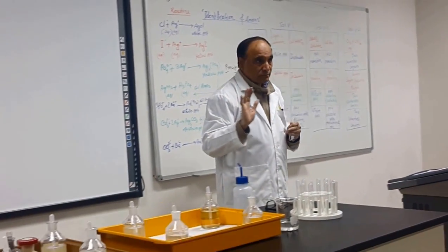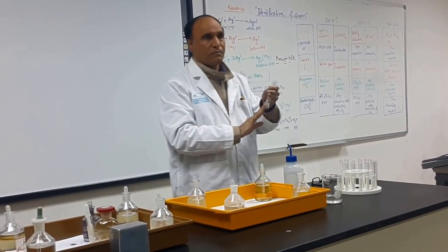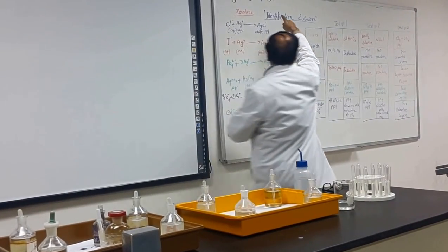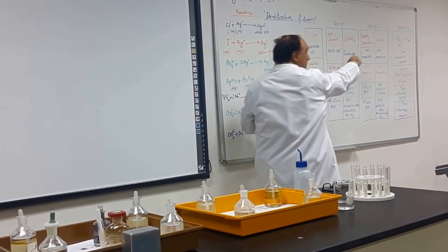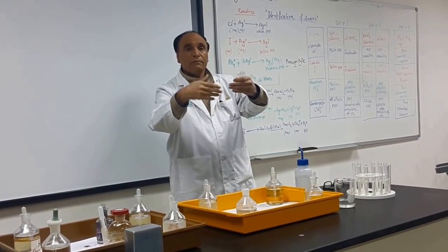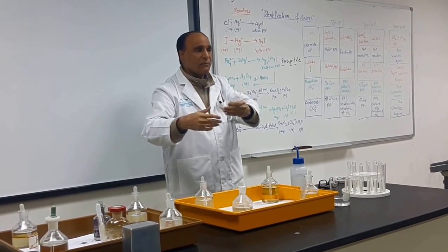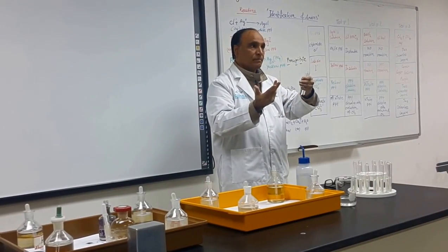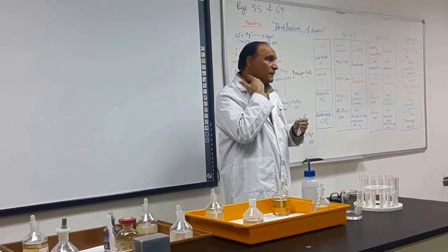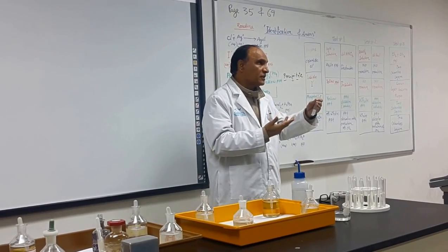Did you understand? Yes. Most of the students, and it is good, use only 3 test tubes. When it is finished, they write the result on page 69, the same result, and then you wash them. Throw them away in the sink, and wash them with soap and with the brush, and use the 3 test tubes again. And put this water again, because you are going to use it.